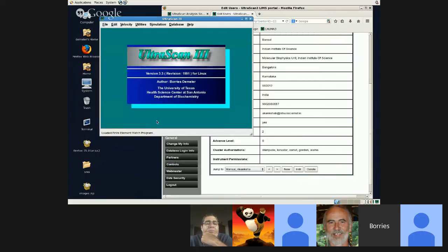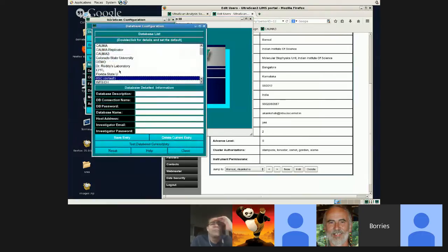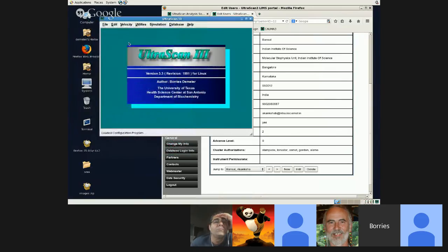What I could do is switch over to my database and show you how things work there. And then meanwhile, maybe Gary can take a look at the India system and get that to work. And so this is what I'm going to do now. I'm going to switch over to my database here so we can continue to work on and show you how to analyze and upload data.